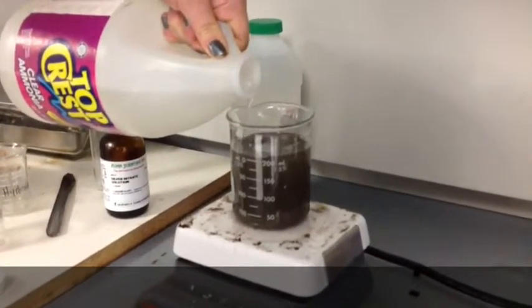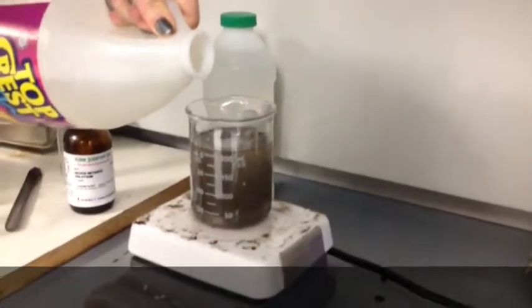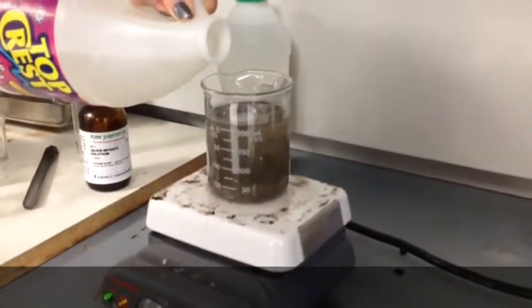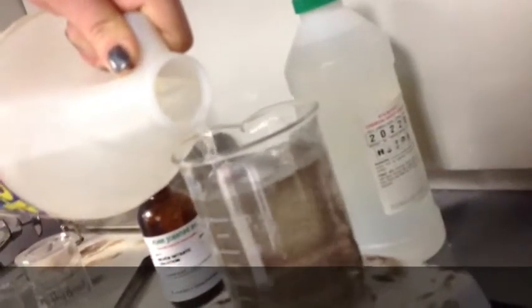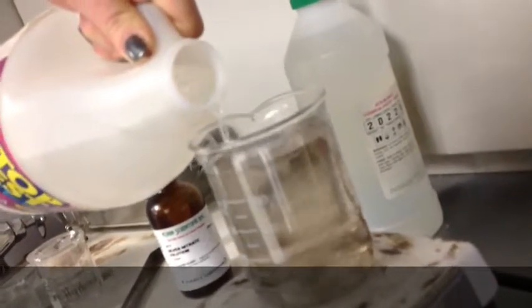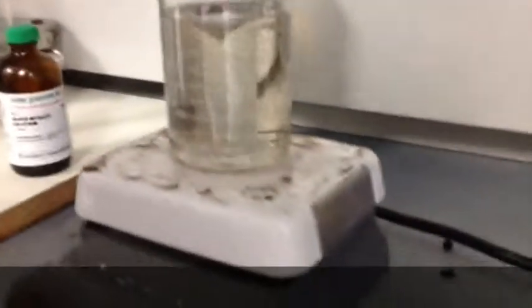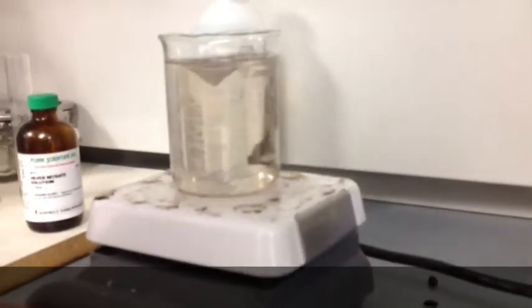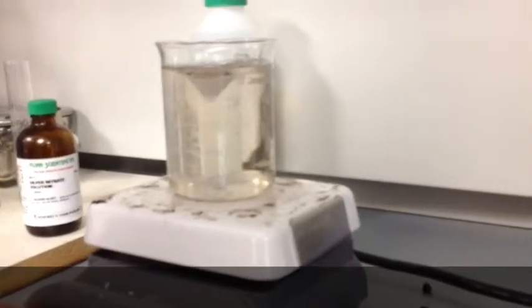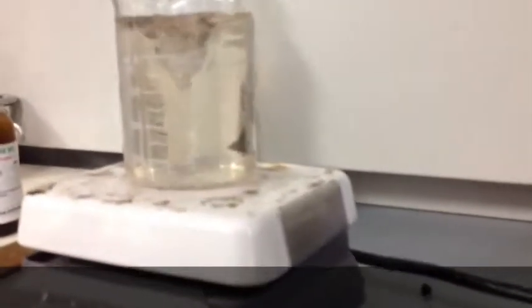And then you get to about this point and you still see some little tiny specks of the solution left over. You can add just a little bit more, and then turn up the stirring just a little bit — it creates a tornado.